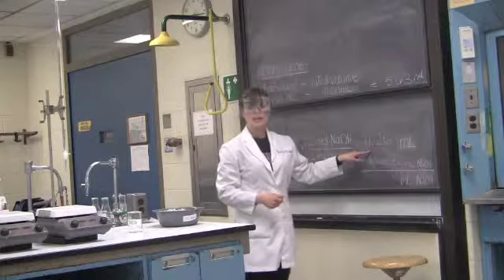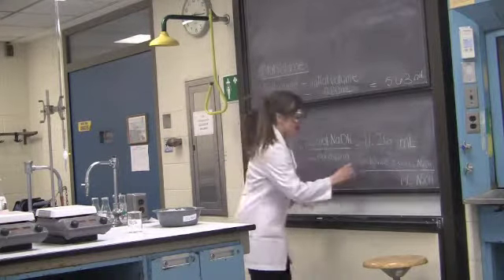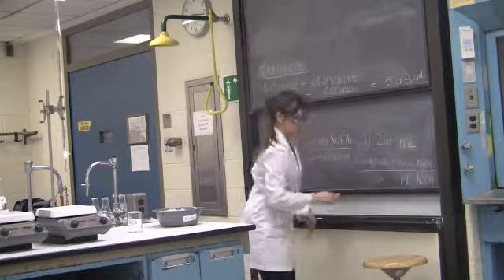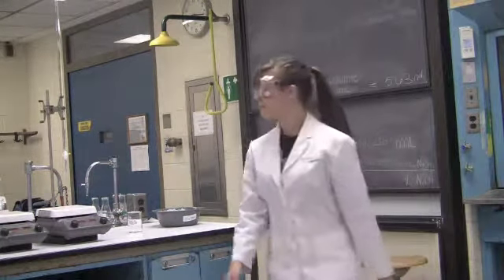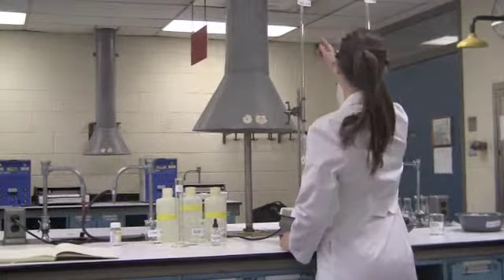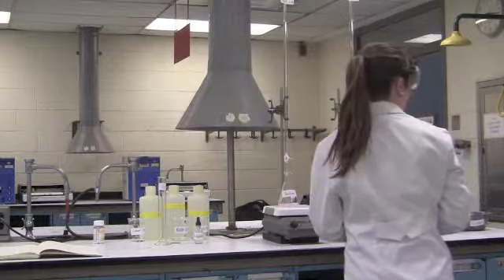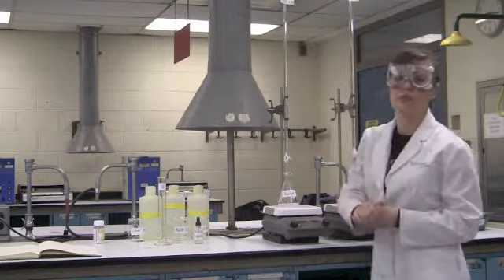We also have to add excess reagent. So we're going to add 10 mLs of excess NaOH, and this gives us a total volume of 21.26 mLs of NaOH. Taylor will now head over to her beaker to add the excess NaOH. Since we are at a volume of 5.63 mLs, we are going to make sure we add it so that we have 21.26 mLs. So I'm going to take the volume all the way down to 21.26 mLs.